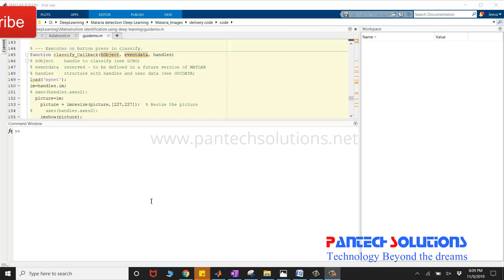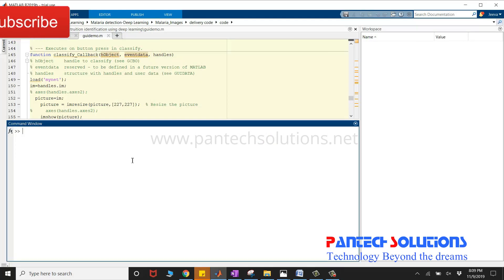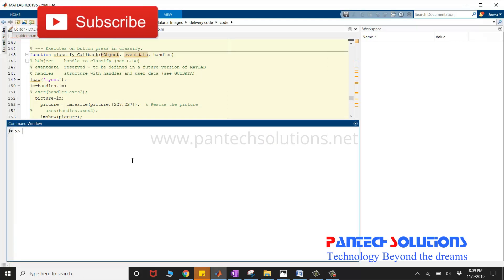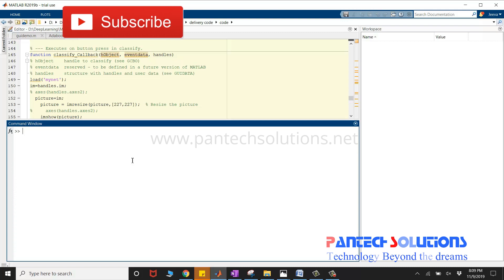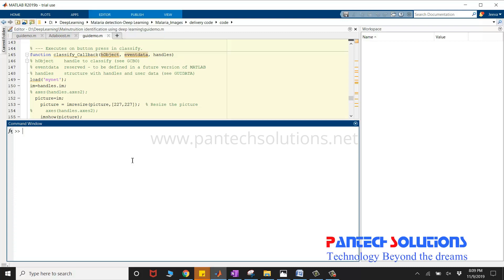Hello, welcome to Pantec Solutions. In this video, we are going to see a demo on Malaria Parasite Stage Classification using Deep Learning.